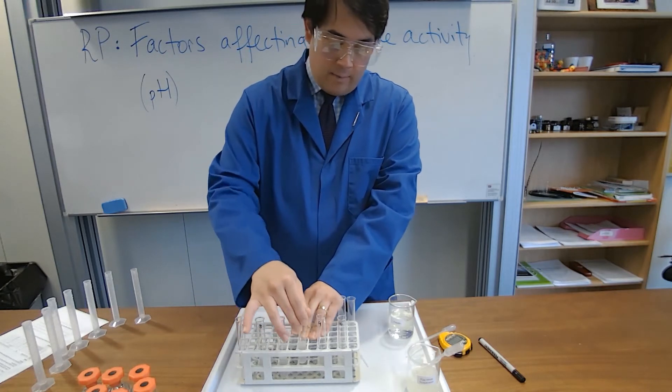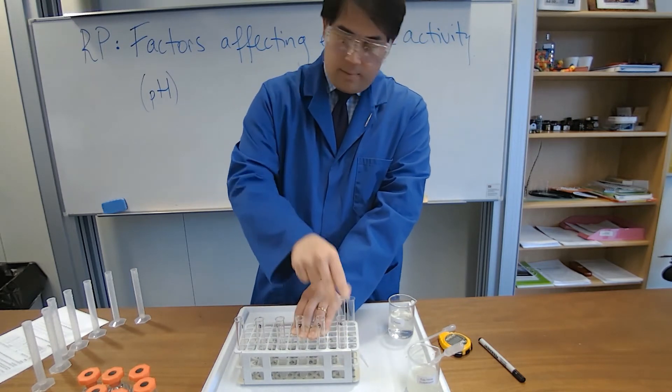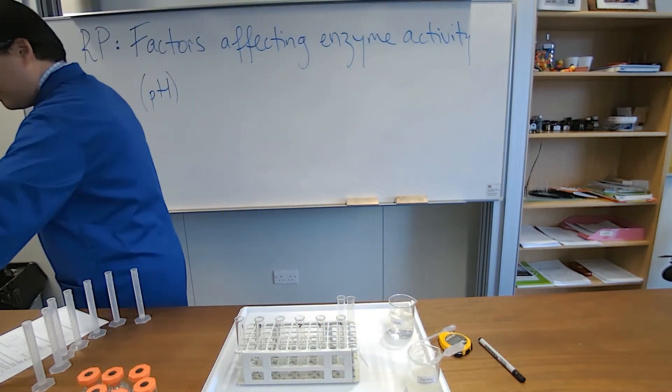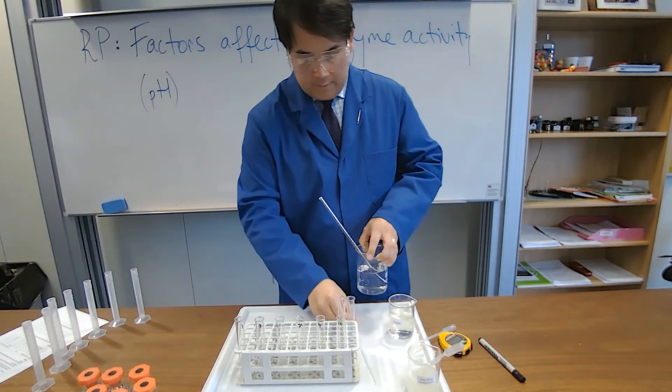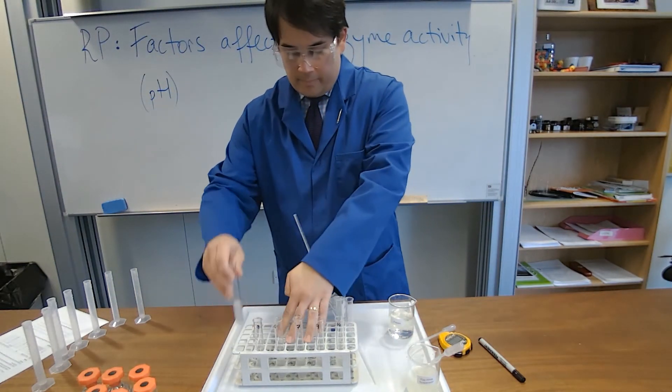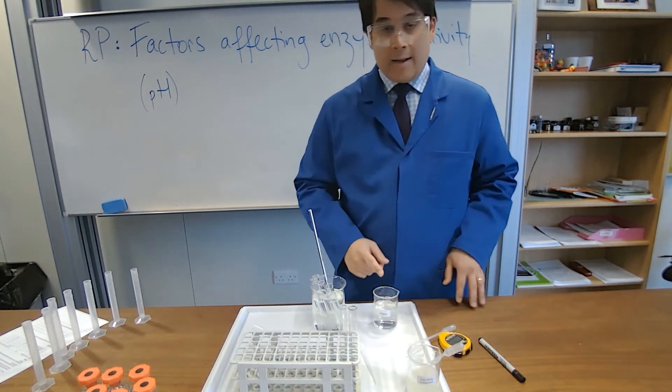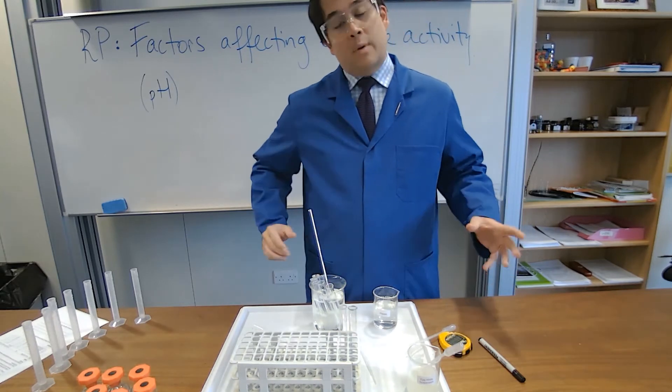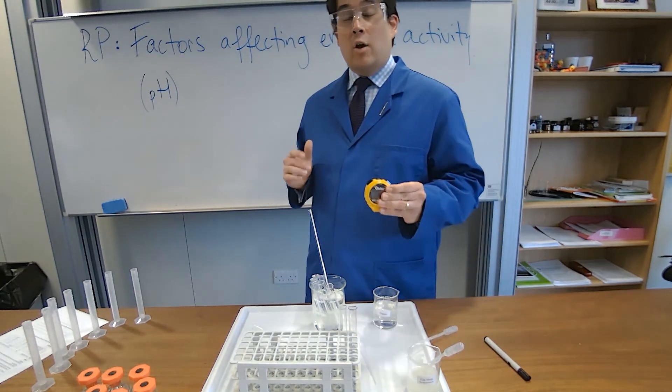Then I'm going to put them, as I said, into a hot water bath, keep them at the same temperature of 40 degrees. Here's one I made earlier, 40 degrees. Okay, and here is our enzyme, and that's going to be added to that once a few minutes have elapsed, and then we're going to time it to see how long it takes to clear.